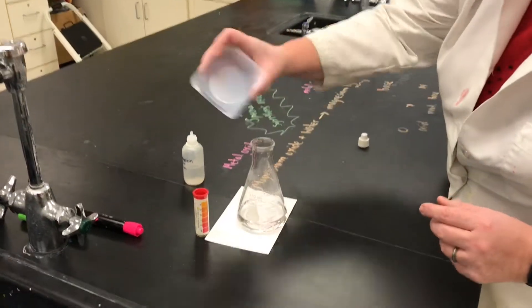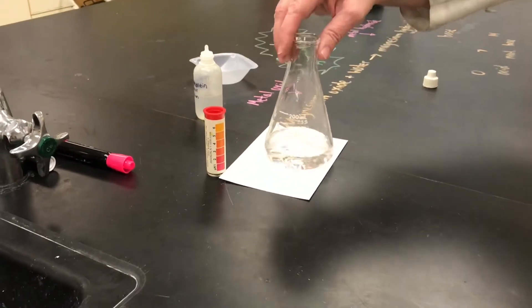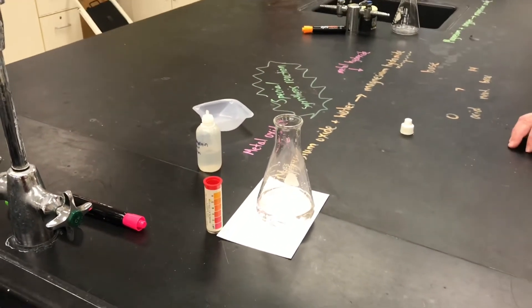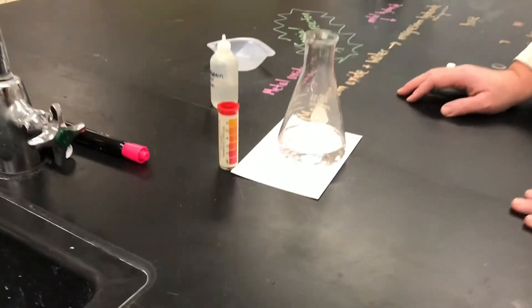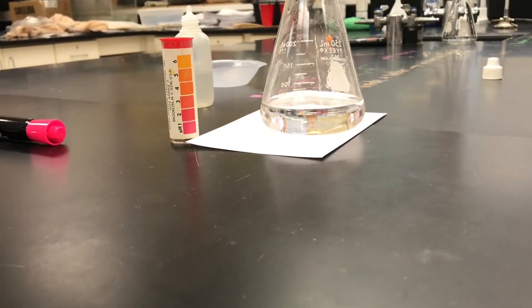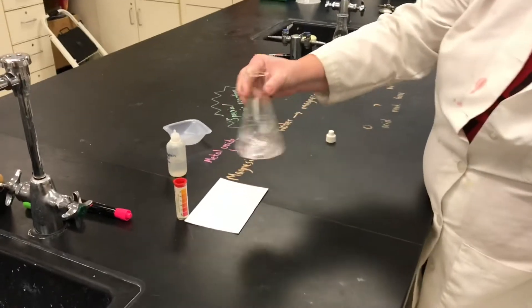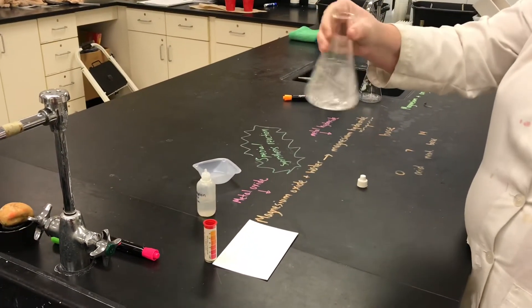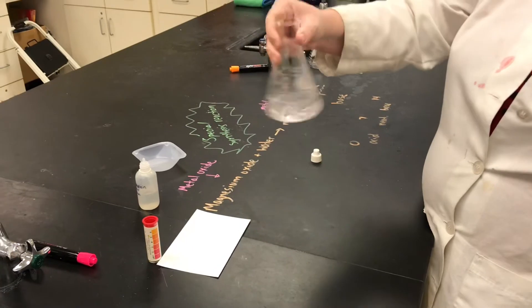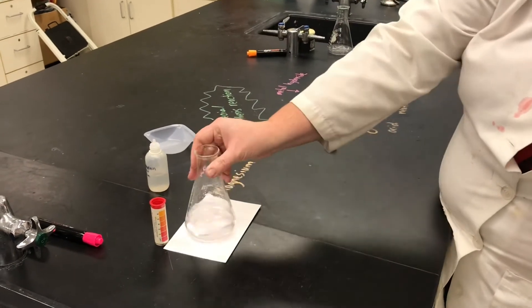The reaction will start — it's not incredibly fast, but right now some of the magnesium oxide is reacting with the water. Right at the surface of the magnesium oxide you can see it's starting to turn pink. This reaction occurs pretty slowly, and I might be able to speed it up by agitating it to knock some of that powder around and increase the surface area of the magnesium oxide. It's taking on a little bit more of a pink color.